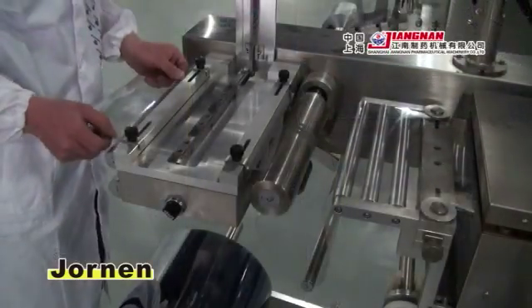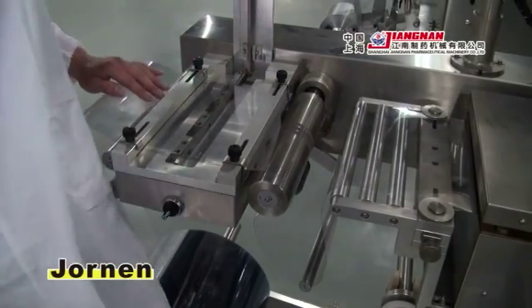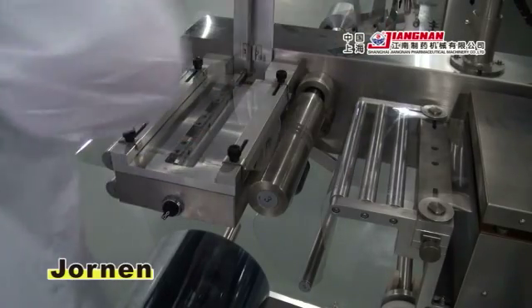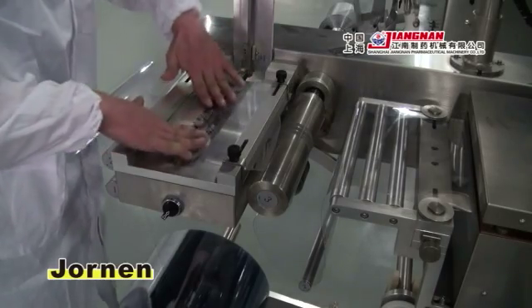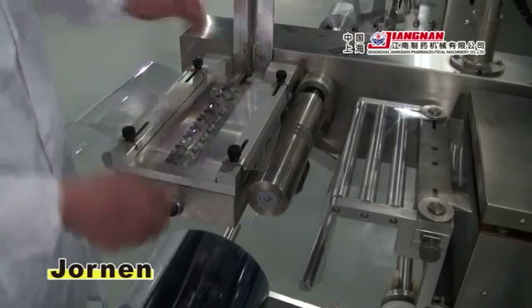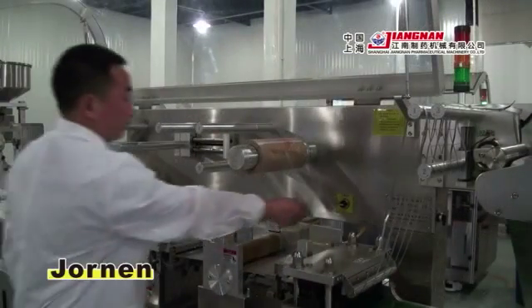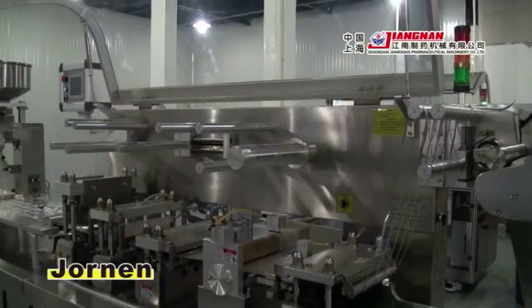Equipped with an integrated forming material splicer. Using a fast lock method enables replacement of lining material easily within 10 seconds.